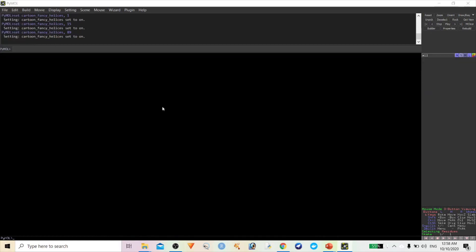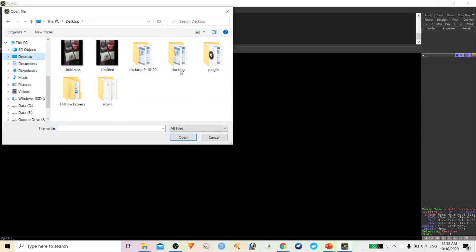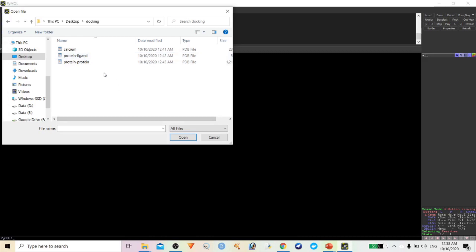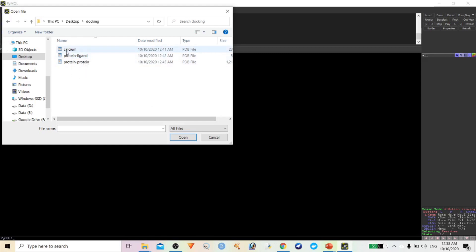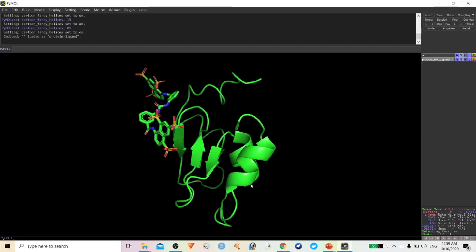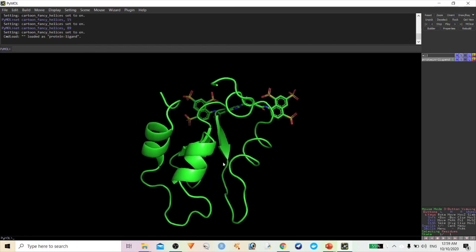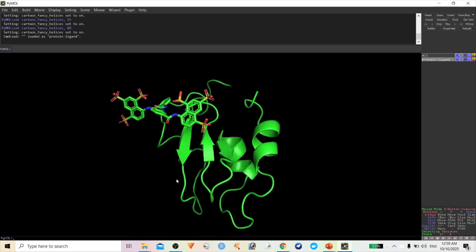So let us start with some advanced features. Go to File here. I previously performed some docking interactions. There are three different types of interaction: one is for protein-protein interaction, one is for a ligand, and another one is the calcium ion metal ion interactions. First of all, I am going to work with this protein-ligand molecule.